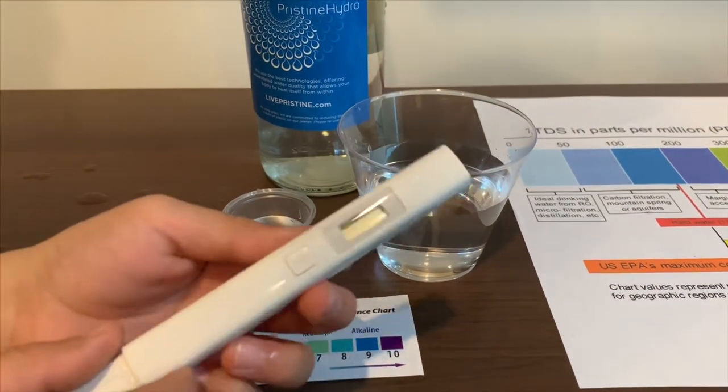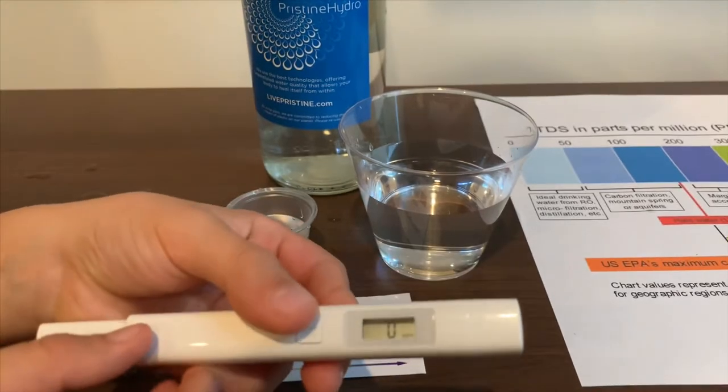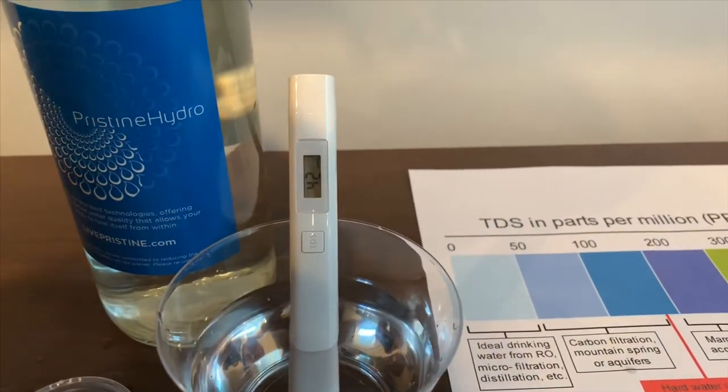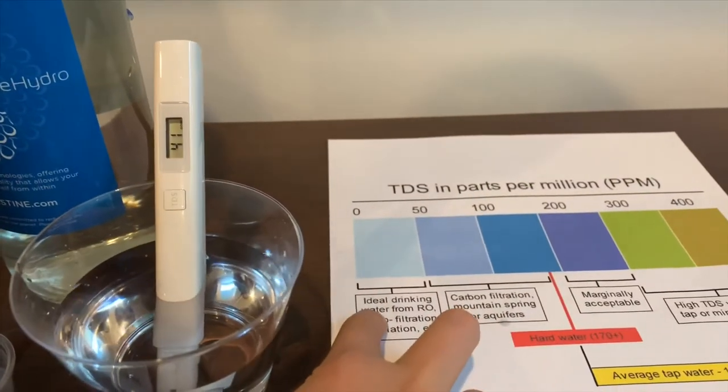If you want to buy this TDS tester, check the link down below. Turn on the TDS tester, make sure it says 0, and put it in. It is 41 — that is ideal drinking water.